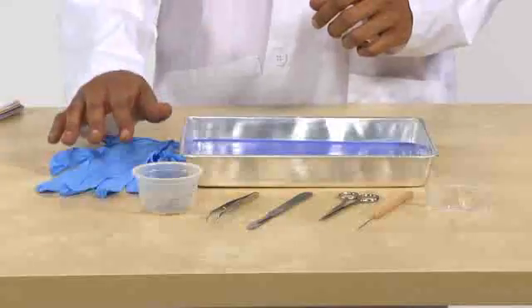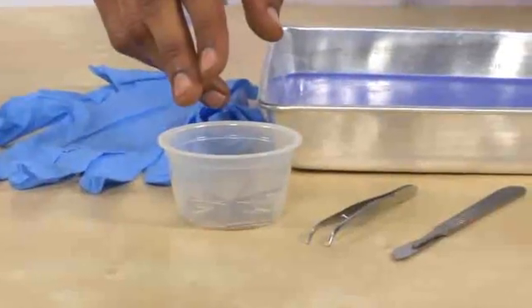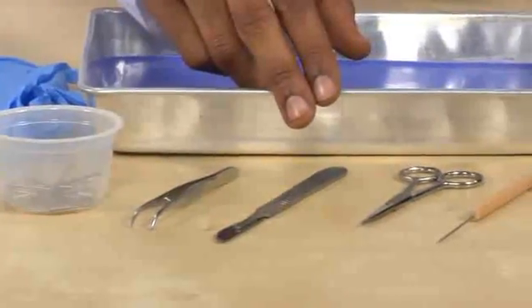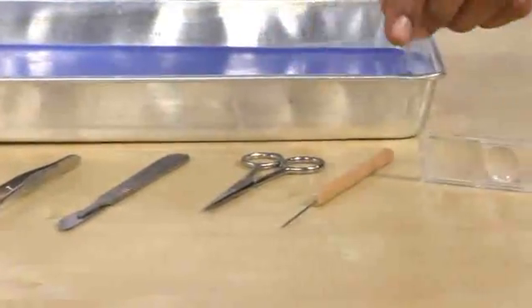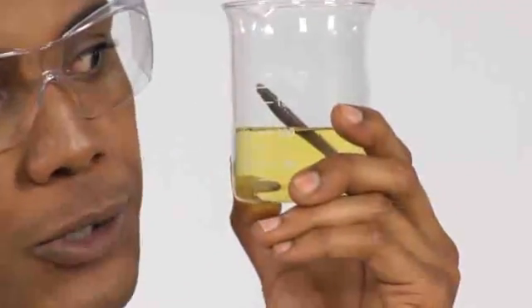Here's what we're going to need for this experiment: gloves, a dissection tray, dissecting pins, forceps, a scalpel, scissors, a probe, and a hand lens. And of course, we can't get very far in an earthworm dissection without a preserved earthworm.